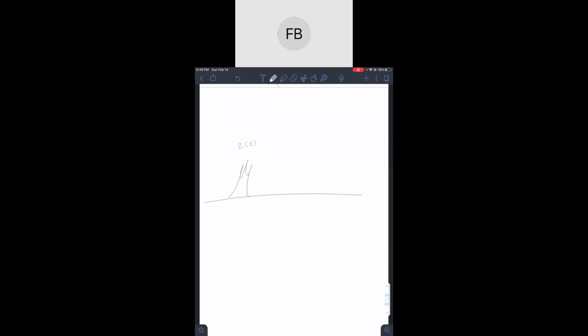On these ones, you're going to have to count. You have to count each of the peaks yourself. 1, 2, 3, 4, 5, 6. I think that's 6. I'm just going to write it here. So this is a 2, 6. Inside the bracket is the number adjacent to it. And this is a triplet. Do you see how you're going to have to read that and figure out how many peaks are in it?